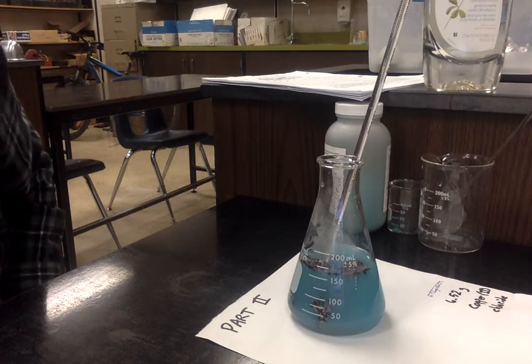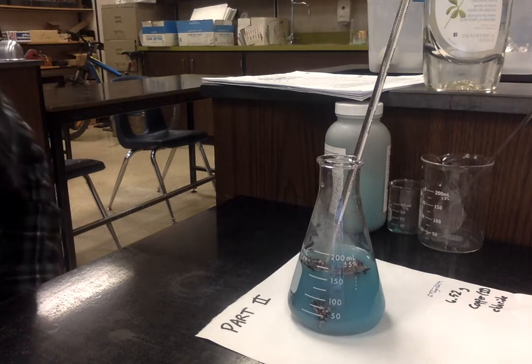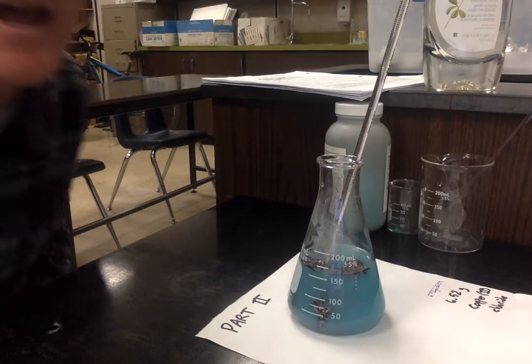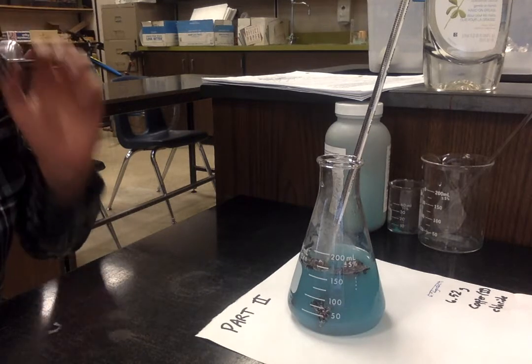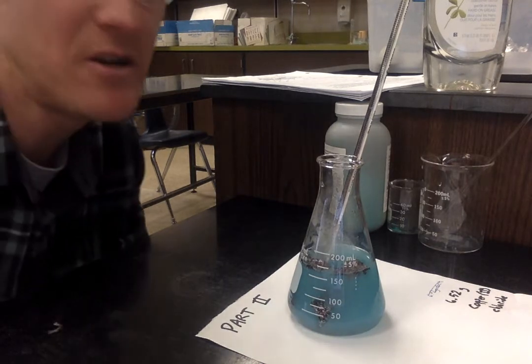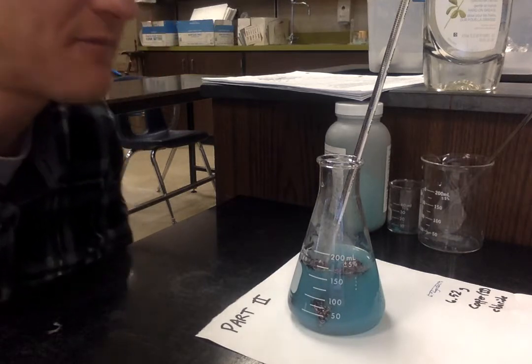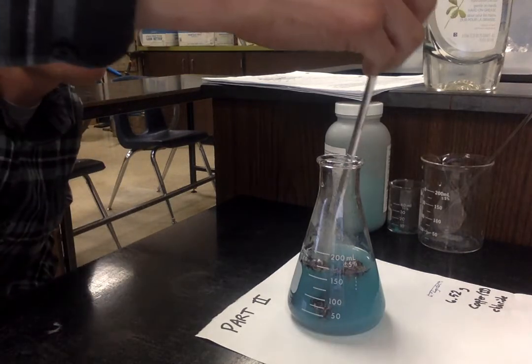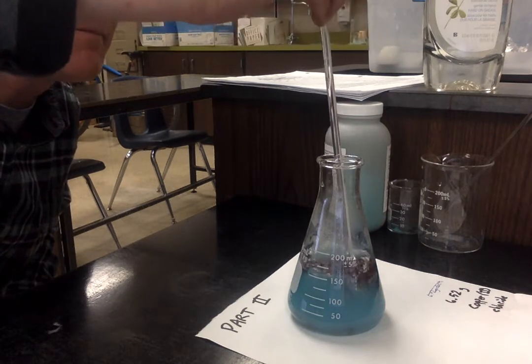The temperature in the calcium beaker is 23.5, and it's still stable at 20 degrees Celsius in the zinc. We've got bubbles here. Of course, I never collected these bubbles. I never planned on collecting them, so we don't know what the volume is. We just know that bubbles are being made.